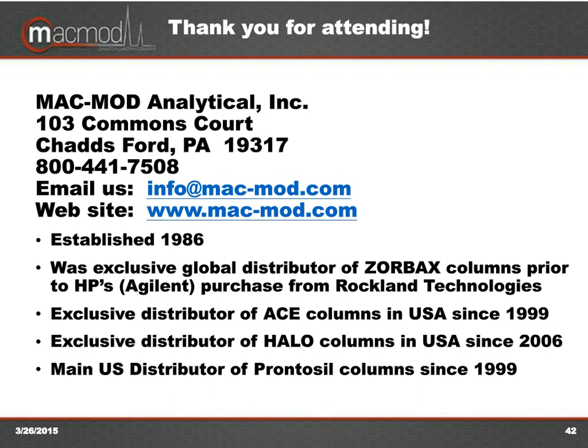Excellent, thank you. And this question kind of goes hand in hand. Can you please explain a little more on using two orthogonal columns in tandem?